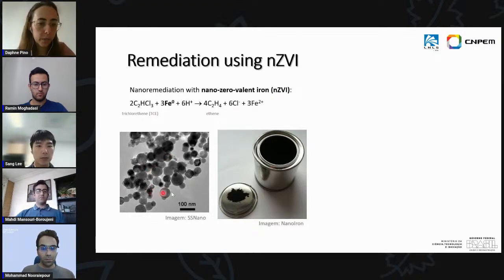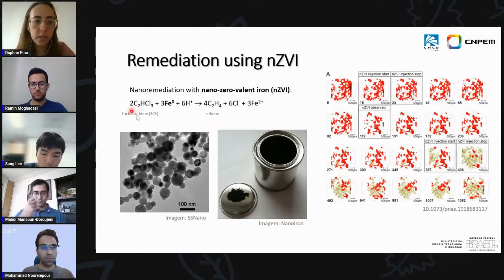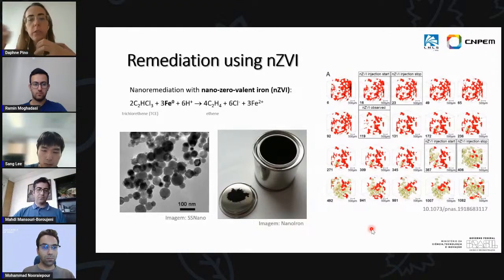So here you can see some images in the microscope of those nanoparticles, and they are usually presented as powder. And what we want to see is how exactly these reactions are happening at a microscale. So this is an example of a paper that our group published. What you see here in red is the solvent, the TCE, and then we injected nanoparticles. After the injection of nanoparticles, what we saw, this yellow part here, is actually gas that was produced during the reaction. We saw the consumption of TCE, but we also saw that this gas was dislocating some of the solvent droplets.